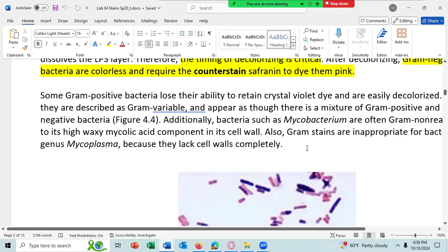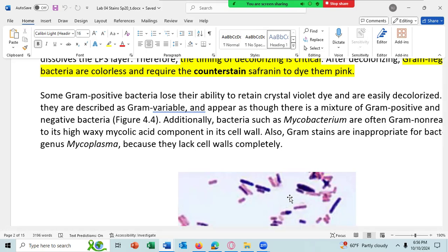So even with the mycobacterium, at least with all the mycobacterium I've been able to look at, I've never seen any mycobacterium that, if the stain was done correctly, where the cells were grown for 2 days or less, ever showed gram variable results. Only if the cells were older, like 2 weeks old or older, did I ever see gram variable results in the mycobacterium.